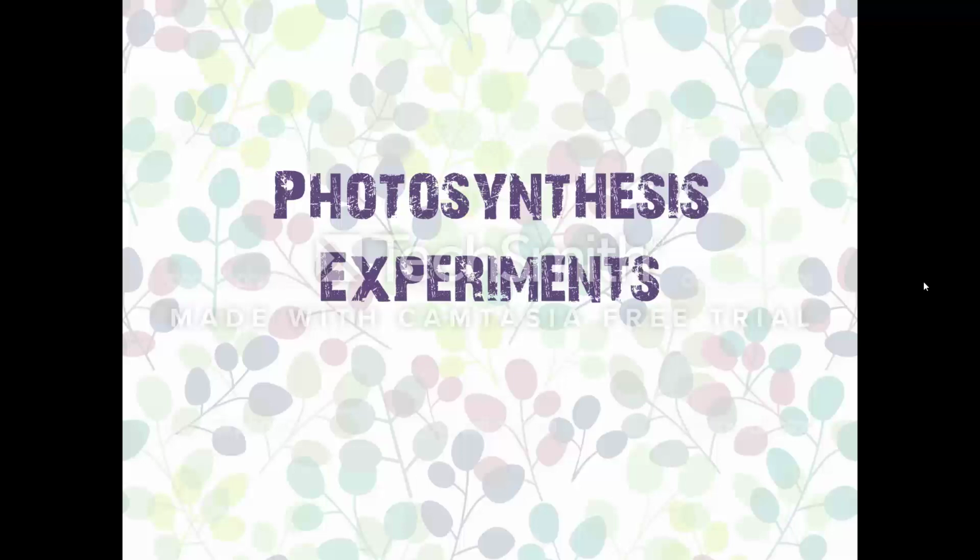This should take you back all the way to grade 8 when you did the starch tests and you did iodine on potato and cheese and bread and those funny things. We are always going to be looking for starch to prove that photosynthesis has taken place.